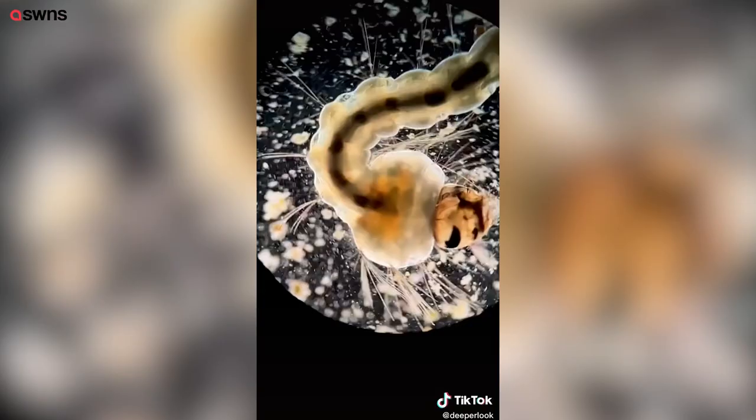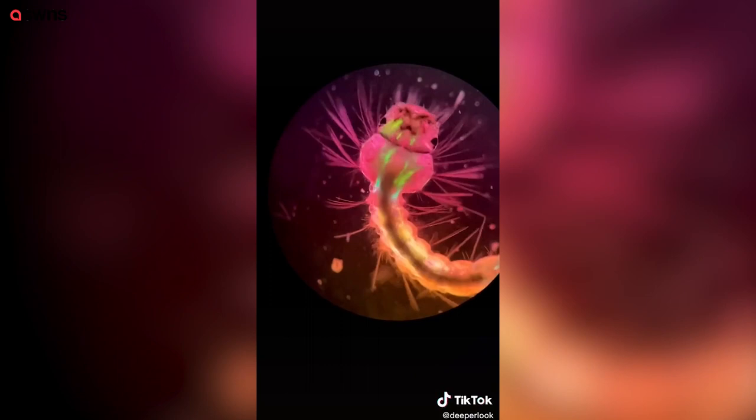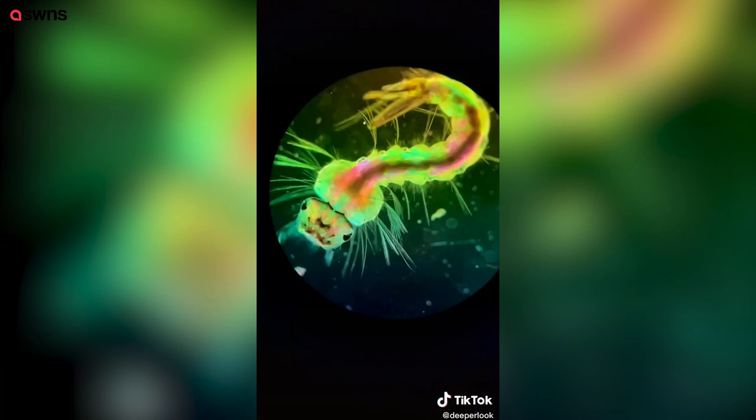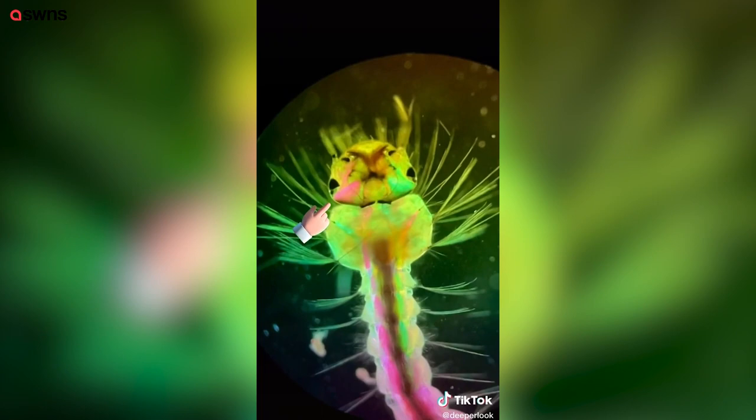We're going to use this to observe the muscles inside of mosquito larvae. As the muscles change orientation on the slide by contracting, they also change color. This is because muscle tissue changes the polarity of the light as it passes through, allowing different wavelengths of light to pass through the second filter. This whole series of manipulating the orientation of light allows us to see these mandible muscles in clear detail.